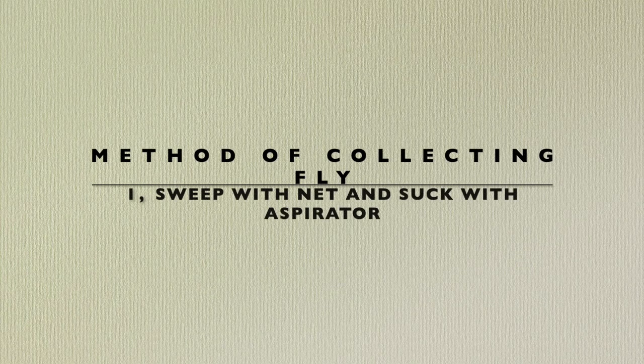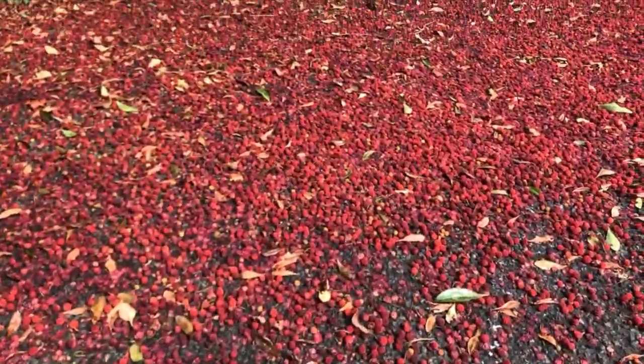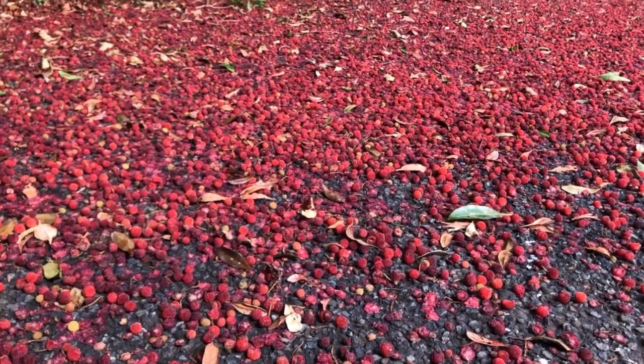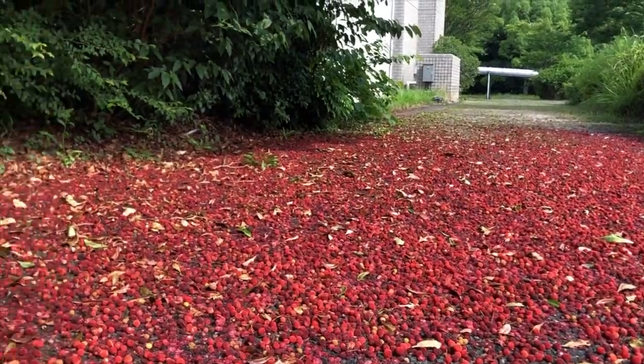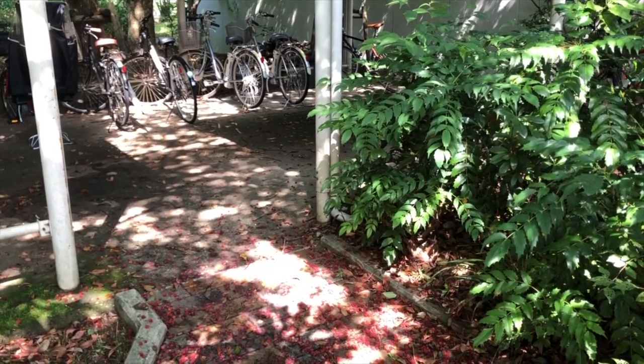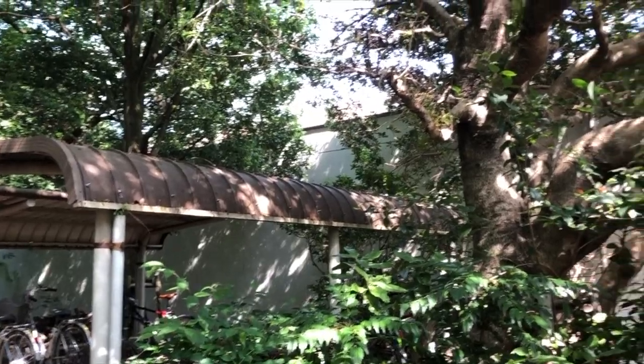In our university, we have several trees that bear fruit in different seasons. For example, in early summer, Yamamomo, which produces many small berries, is in a good season. Almost all species of Drosophila are attracted to rotten and fermenting fruit, so the timing when the fruit becomes overripe is ideal for collection.